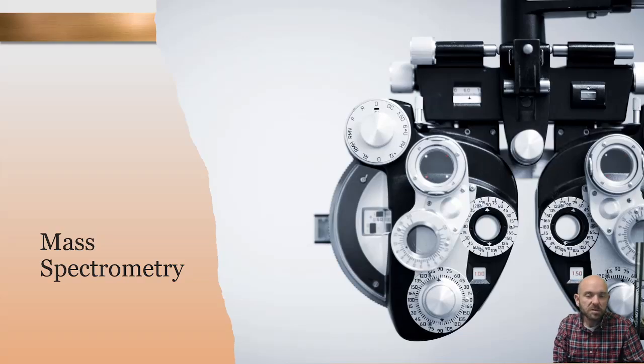Hello everybody, Mr. Brown here, and in this presentation we are going to discuss mass spectrometry. This is yet another technique that we use in the organic chemistry laboratory to elucidate the structure and other information about our molecules. So if you'll follow along with me, I'll tell you about the theory behind this technique and the information that we can gain from it.